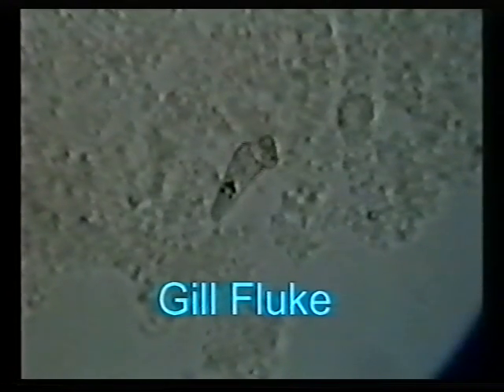Here we see the gill fluke. Differing from the skin fluke, the gill fluke is an egg layer. They are also only a quarter of the size of skin fluke. Therefore, 200 times magnification would be more appropriate. They are easily identified by 4 black eye spots on their anterior end, as can be seen here.